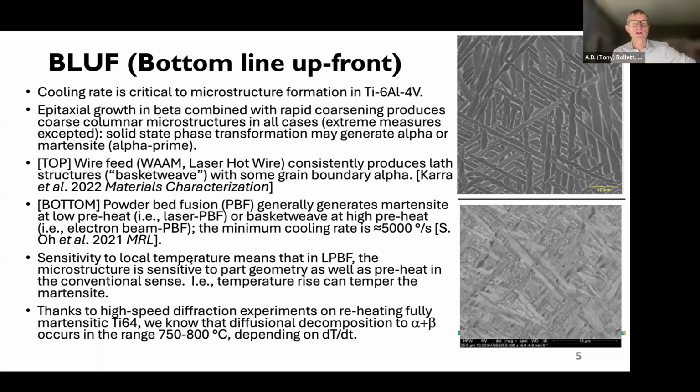When it goes through the phase transformation, if that happens slowly enough, you get a nice, well-developed lath structure. You see an example of that in the top right. That's what you typically get with wire deposition.